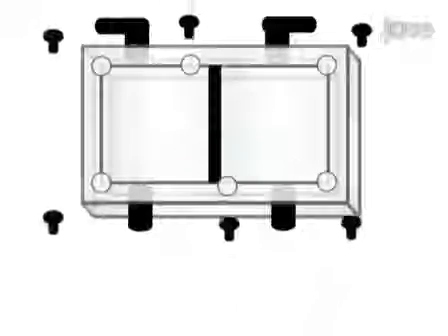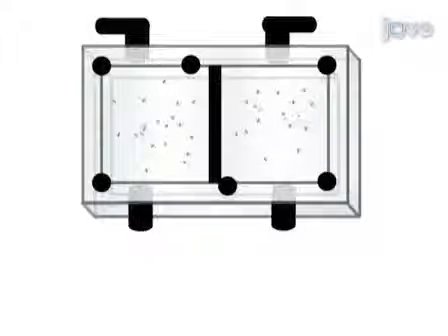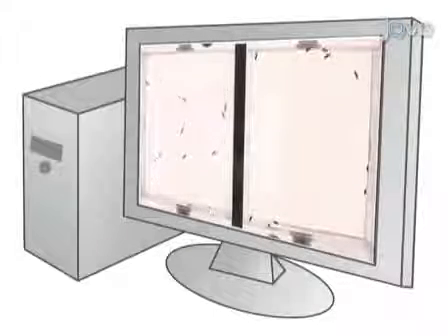Screws then seal the holes of the chamber, and an air pulse is administered through the air vents to initiate locomotion. A video camera suspended above the chamber captures this locomotion and sends it to a computer, where the paths of the flies are traced and analyzed.